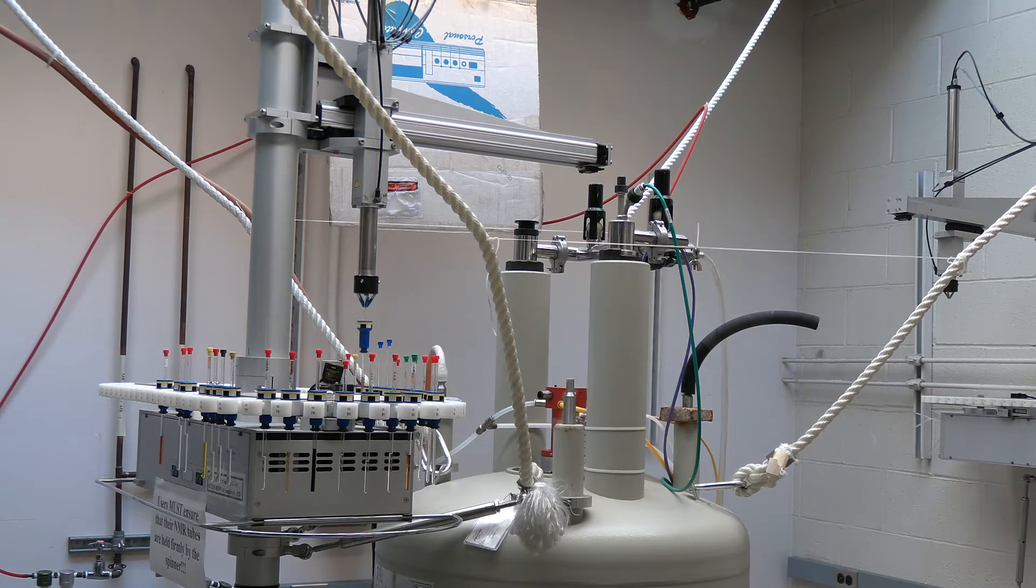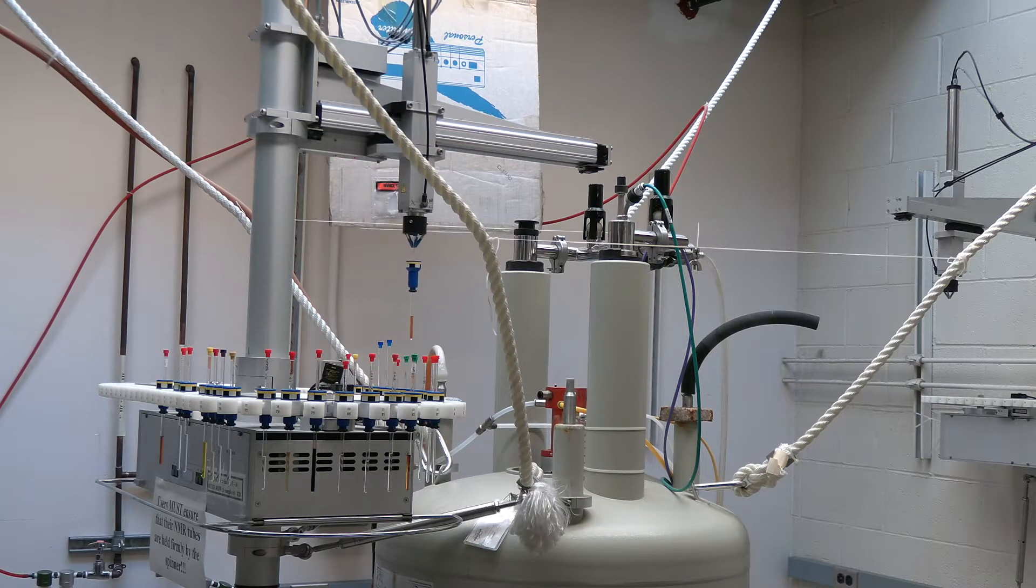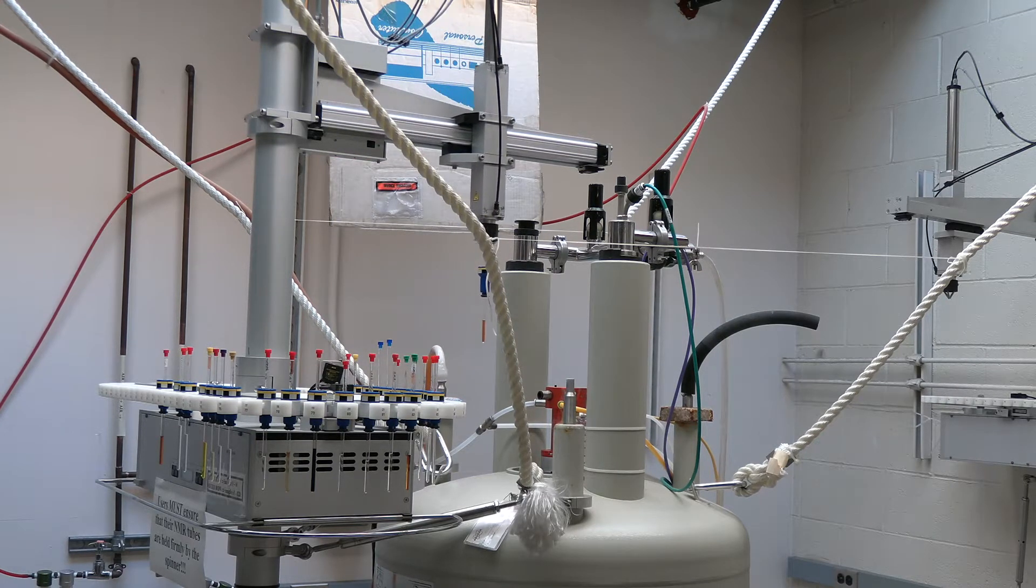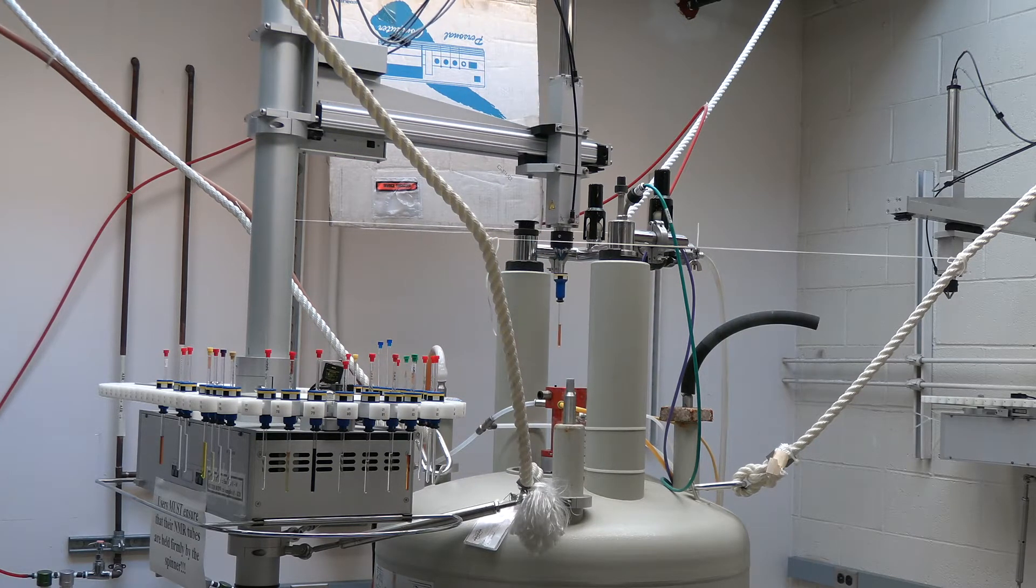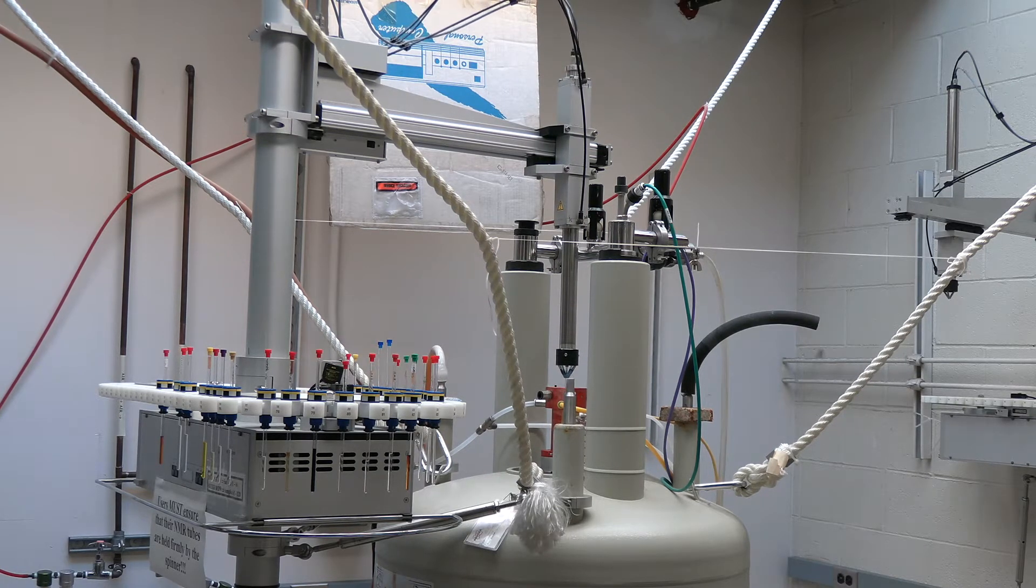Here we are watching how the sample changer transfers samples from the carousel to the instrument. You'll note that the samples are picked up at the top of the NMR tube. This is important because if your tube is not tall enough the arm will not actually be able to reach it and pick it up.